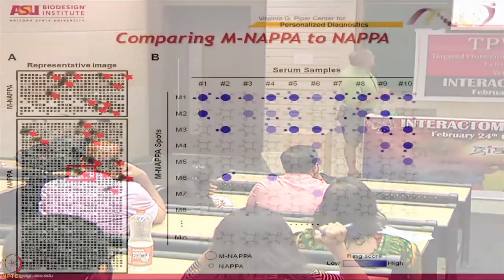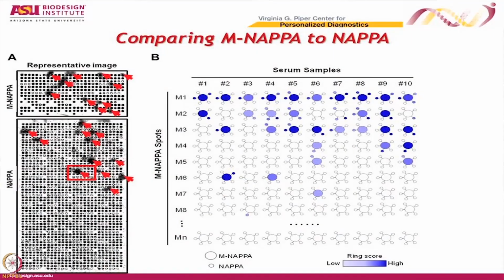Yeah. All right. So I think here you can see that would be like a 5, that ring right there. Whereas this one probably would be a 1 or a 2. So there you can see the spot there. You can see a little bit of the ring right there. This one is like, that's a 5. It's spilling all over. You know, this might be a 3 up here, that sort of thing. So you get used to it after you do a lot of these.